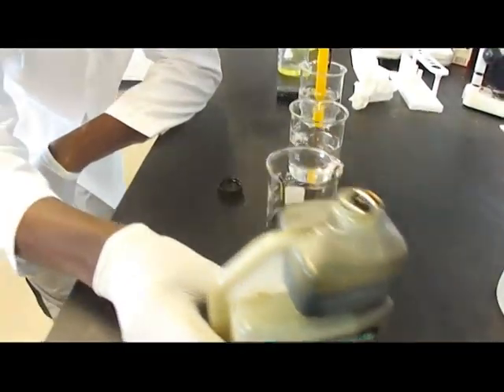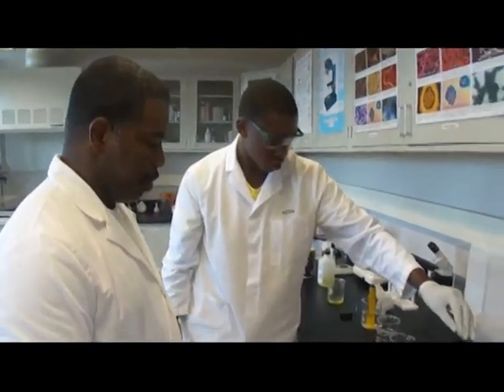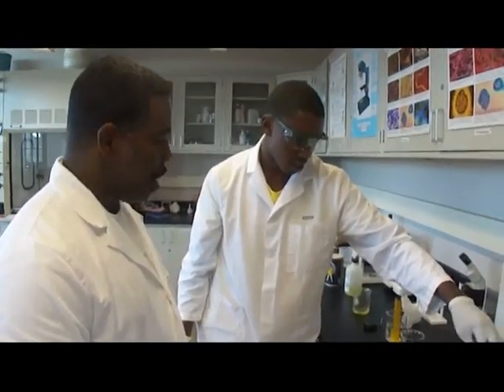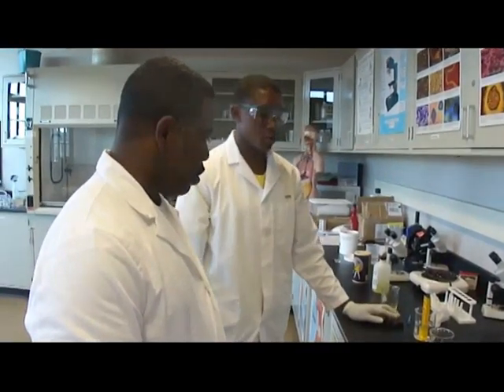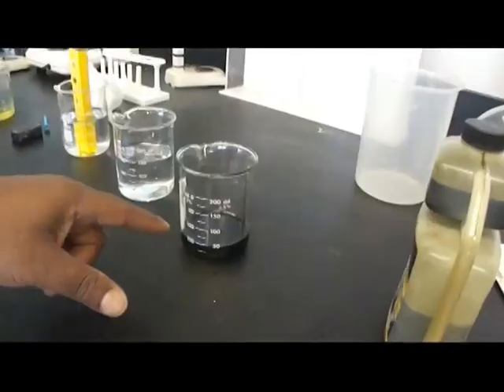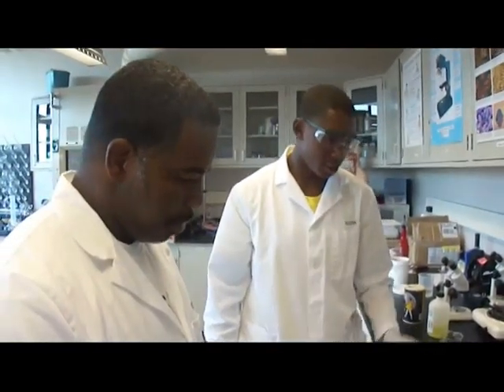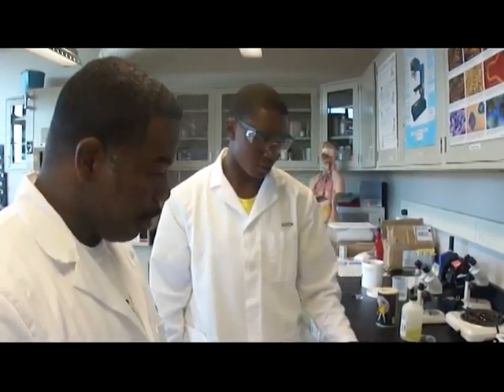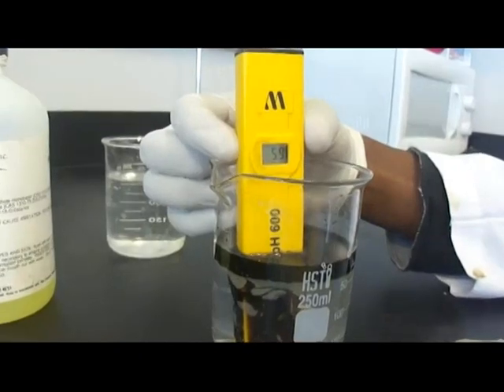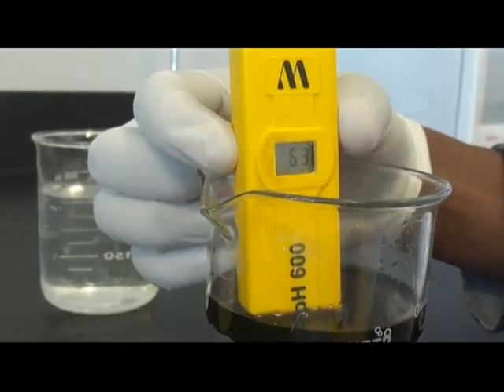Okay, so what you got here? Well, right here, I'm doing the pH of the oil and the water. What is the pH scale? The pH scale is a scale that tells how acidic or alkaline something is. All right, so what are you expecting to happen? I'm expecting for the pH to increase. You expect the pH to increase? Once we add the oil and the water together. Okay, so the pH of the oil and the water is at around 6.3 to 6.4.